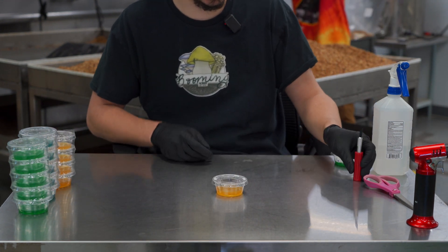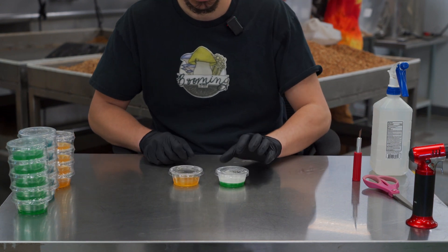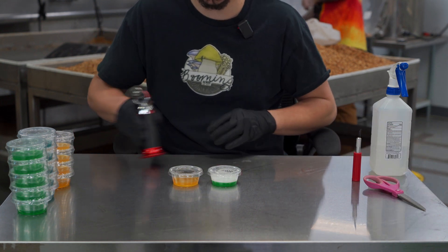These cups come fully sealed — they don't need tape or anything to use them. I've got an example here of a cup that's fully colonized.